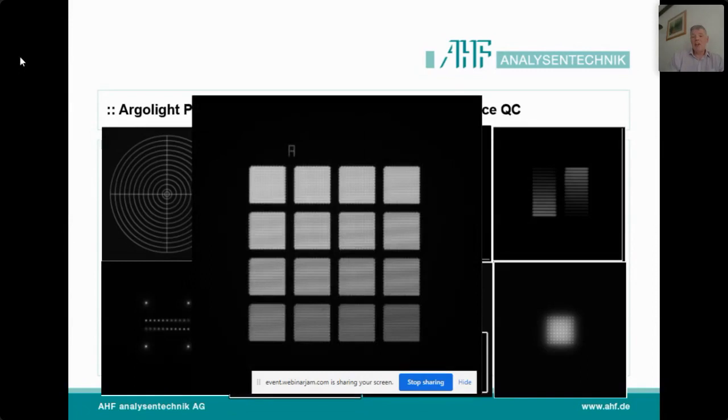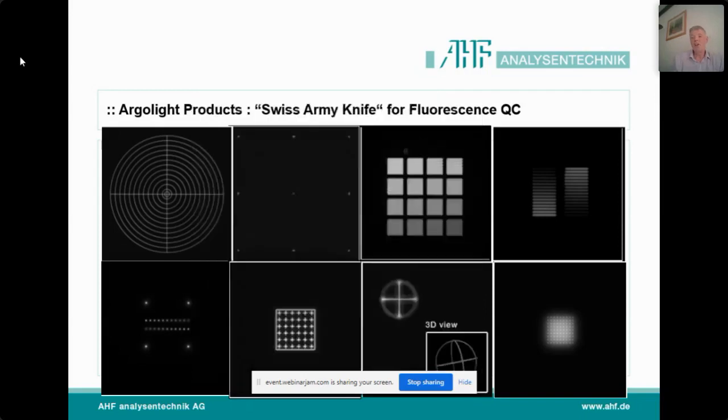So these are intensity squares, and they're a set of grid lines, which are used for a few measurements, and you can tell by sets of line profiles going across them in the measurements.